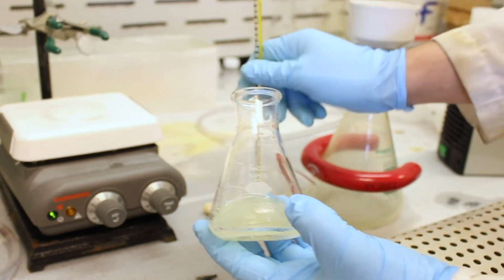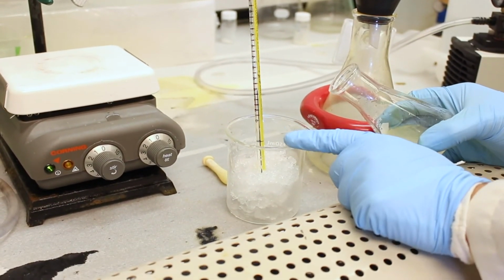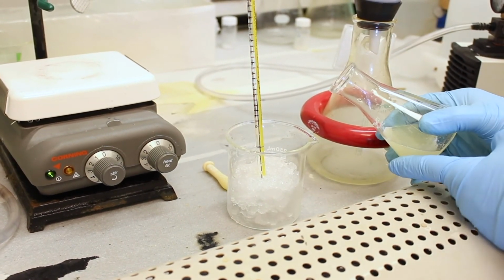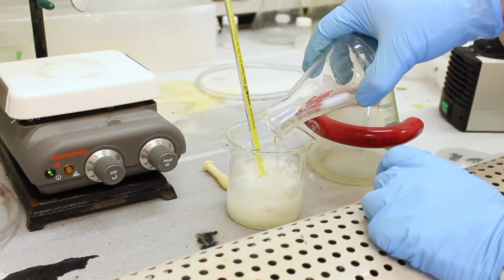So what we're going to do is take this mixture and pour it onto crushed ice. The reason we put it onto ice is because the sulfuric acid in here is exothermic when it mixes with water, so the ice helps keep the temperature very low. So there you go.